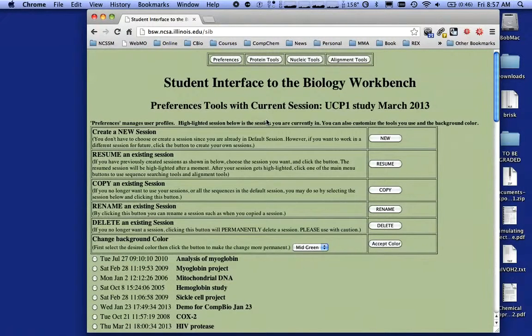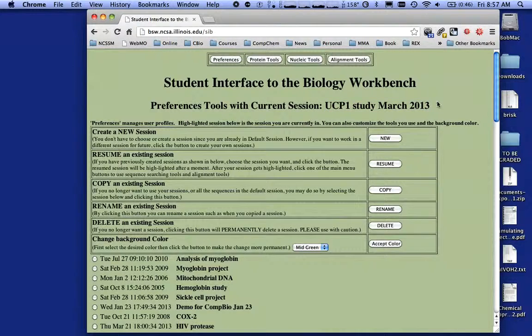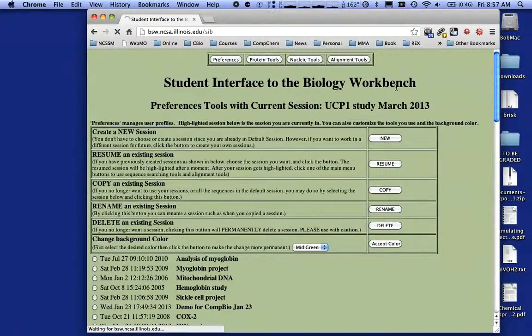We're waiting for it to register. Now I am in that session and because I want to study a protein — in this case UCP1 — I'm going to come up here and click on Protein Tools.